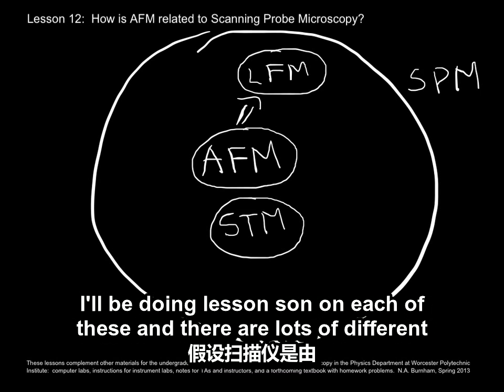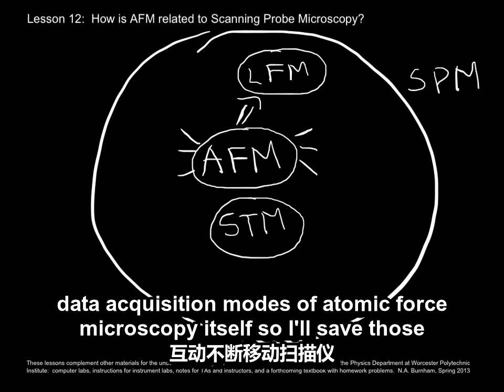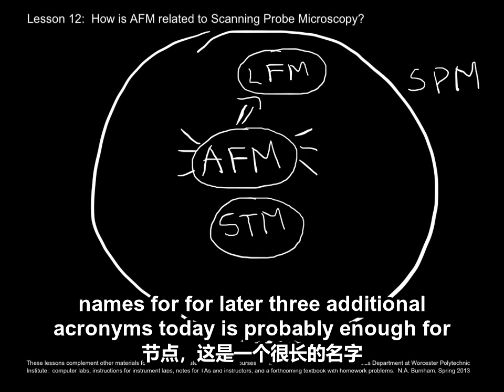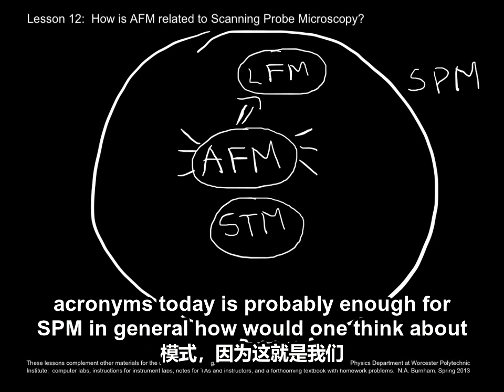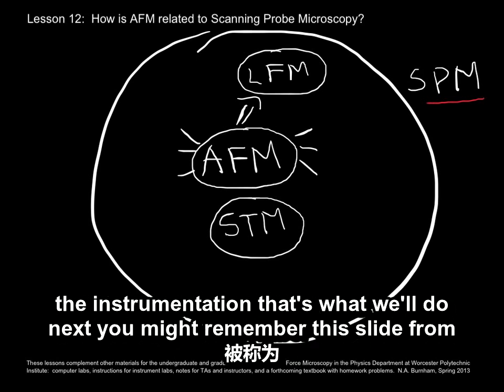And there are lots of different data acquisition modes of atomic force microscopy itself. So I'll save those names for later. 3 additional acronyms today is probably enough. For SPM in general, how would one think about the instrumentation? That's what we'll do next.